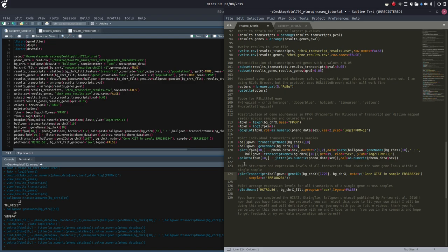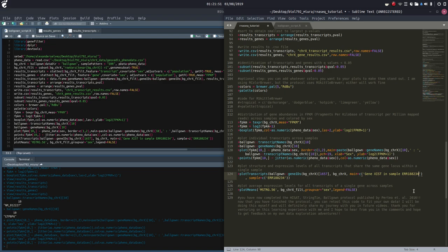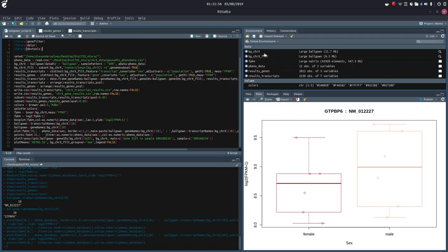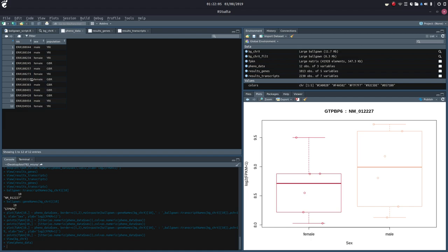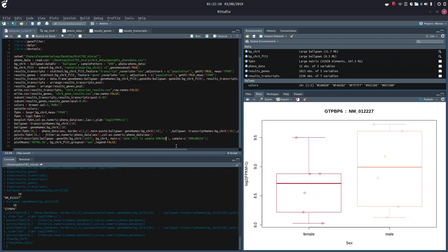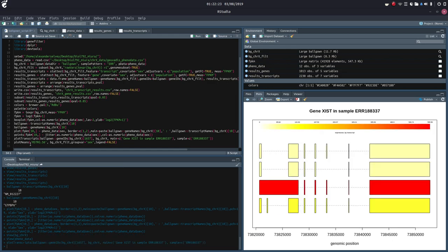So we're going to look at plot structure and expression levels of all transcripts that share the same gene locus within a single sample. We're going to plot transcripts using ballgown gene IDs — not 1729 but 1657 — with BG_chromosome_X as our environment and our title. I kind of wanted to use sample 337 because it really showed a nice difference in the colors. So we're going to plot our transcripts now.